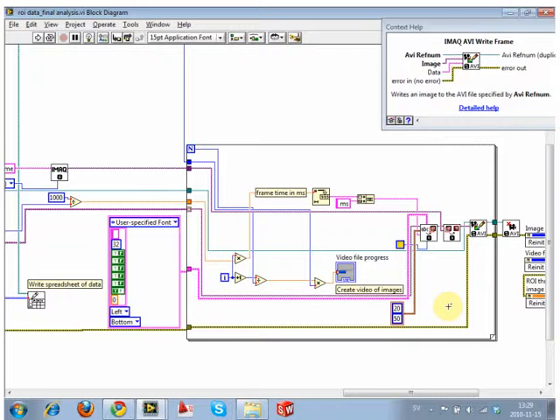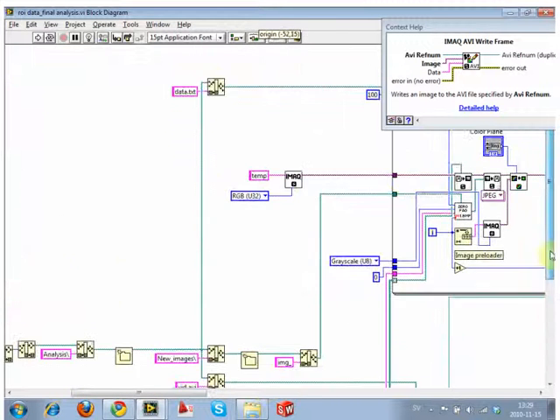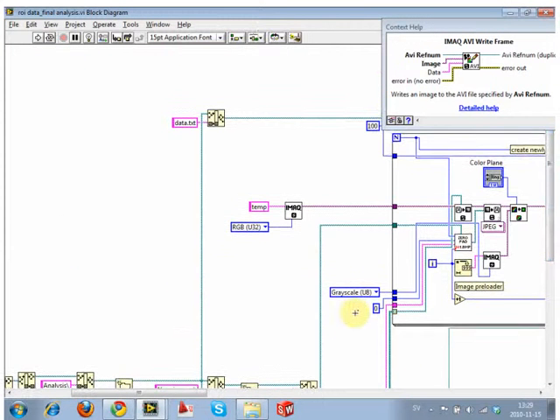Saving all of the original files, just renamed, is worthwhile, because this is your original data. It's good to have it. But the actual data that we're finishing with, once we have that AVI file, we're good. So just that as a prerequisite.